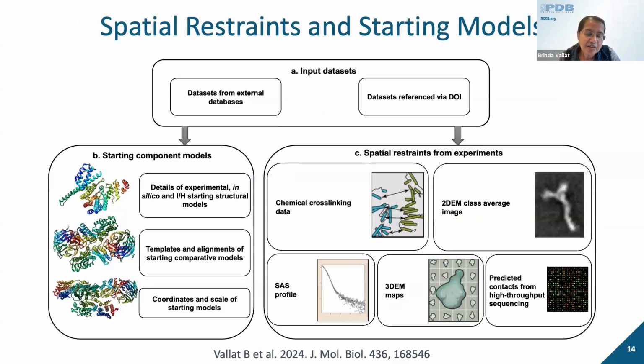Another important factor about integrative structures is the diverse kinds of spatial restraints and starting models that can be used in integrative modeling.